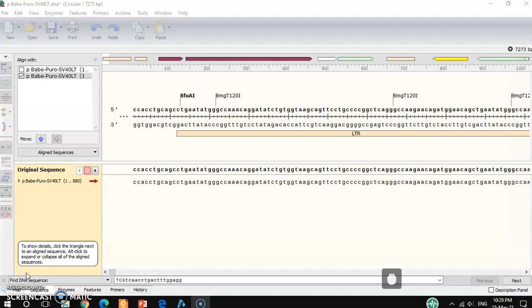I made several videos on Snapgene: how to use Snapgene and how to make primers using Snapgene, and there are different features and how to use them. So I made several videos in different parts. If you would like to watch those videos on Snapgene, I think you should watch them.